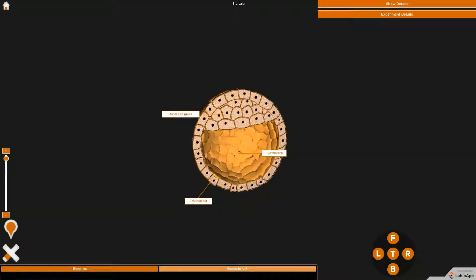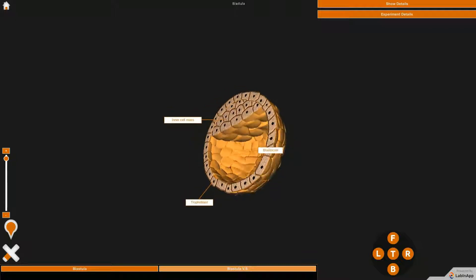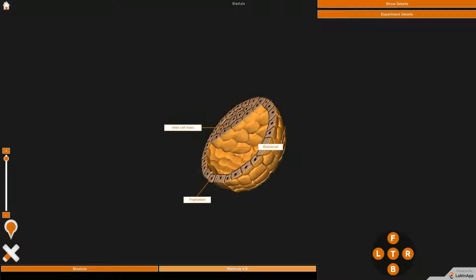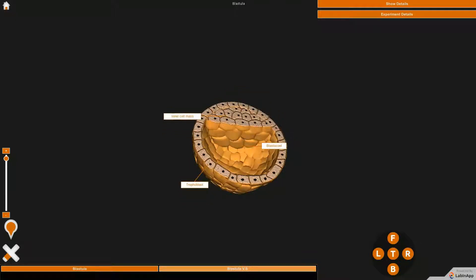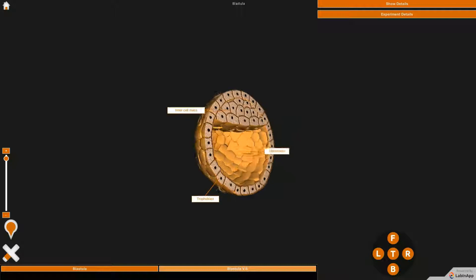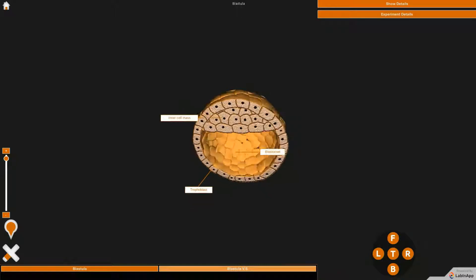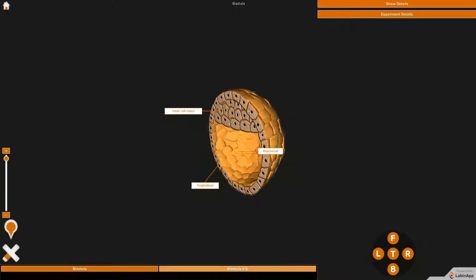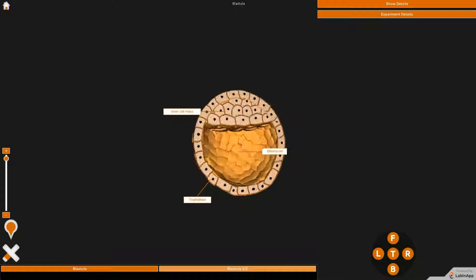a blastocoel. In transverse section, the blastula appears as a sphere with a cavity called blastocoel. The outer layer of blastomeres is called the trophoblast.